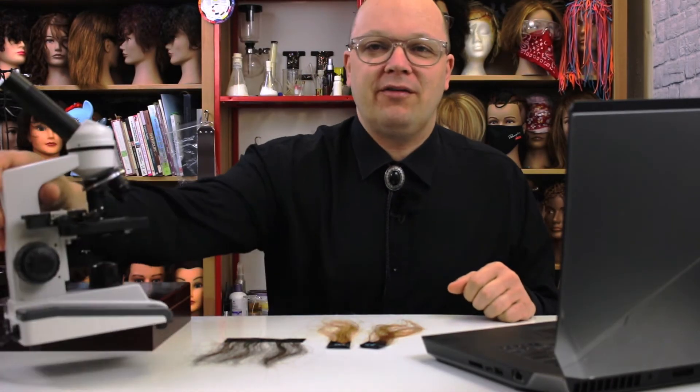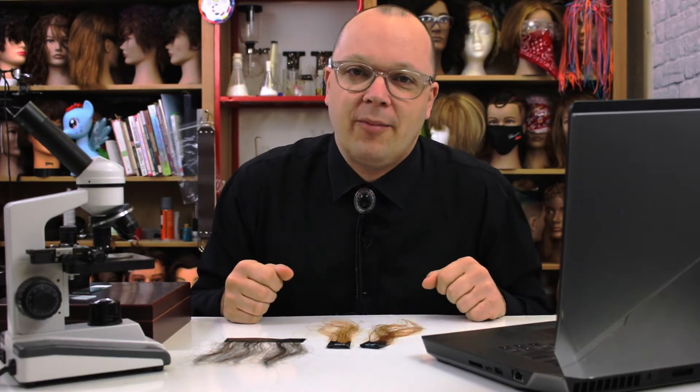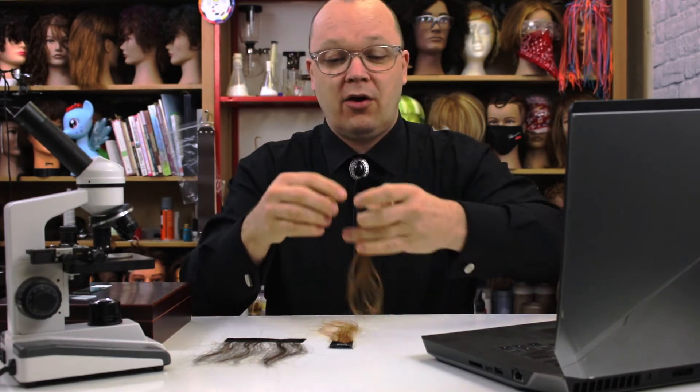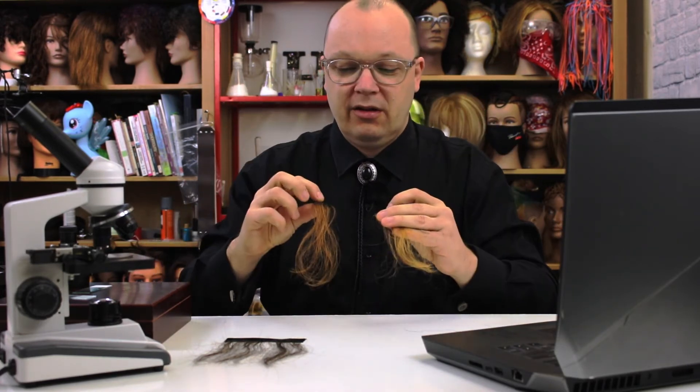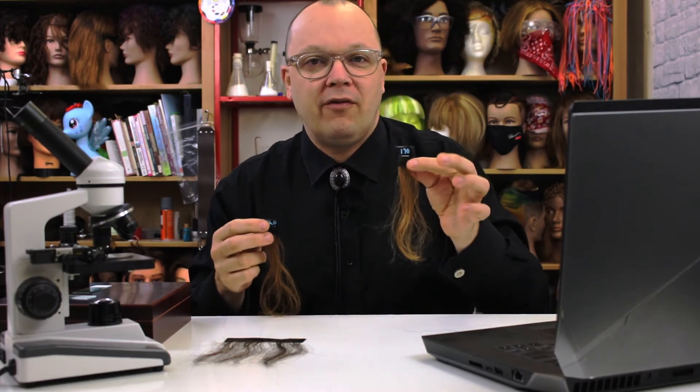Welcome back. Today is microscope day. I've got my trusty microscope and a lens adapter so we can take a look together at hair under a microscope — not just any hair, but specifically our 20 volume and 130 volume test swatches. If you caught that video, we saw the difference between the lift of 20 volume for one hour and 130 volume for one hour, and you can see by these swatches there's a little bit of difference.